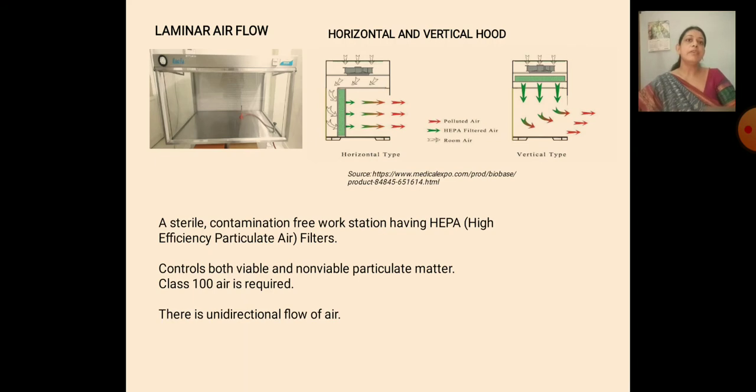The last most important instrument of the microbiology lab is the laminar airflow, also called the contamination free workstation or the sterile cabinet. This is the model. Here we have a filter, a blower, two light systems, one a UV light system and the other a normal light system, a glass cover, and a Bunsen burner.